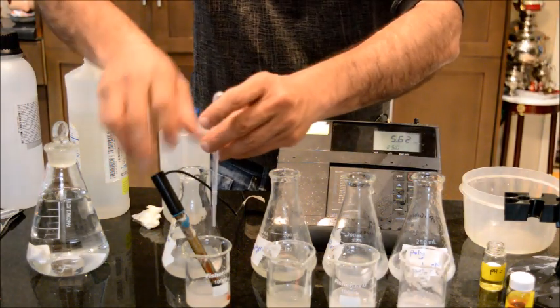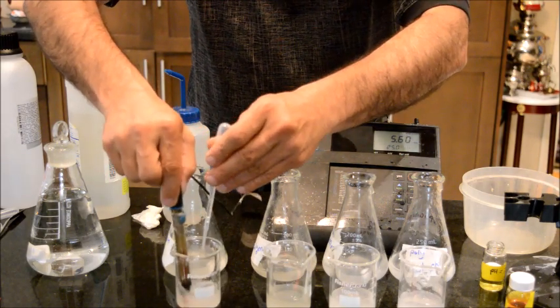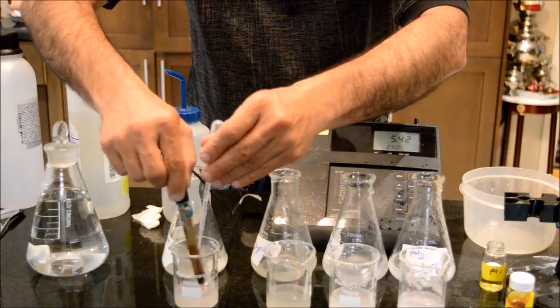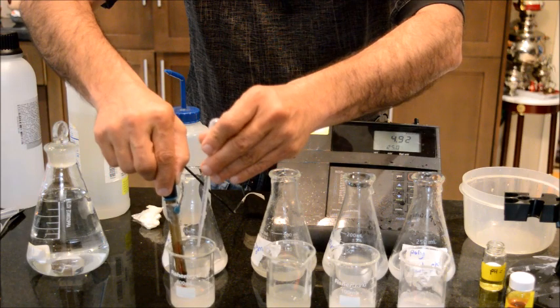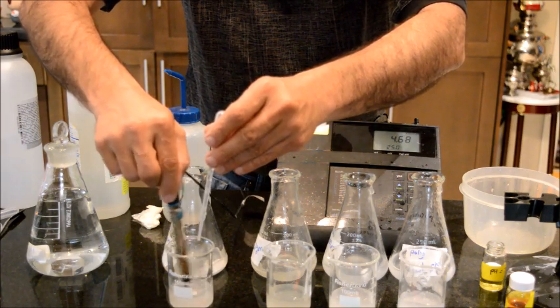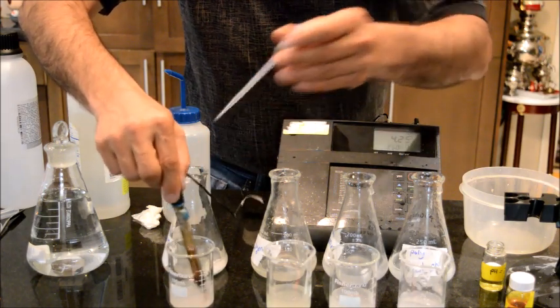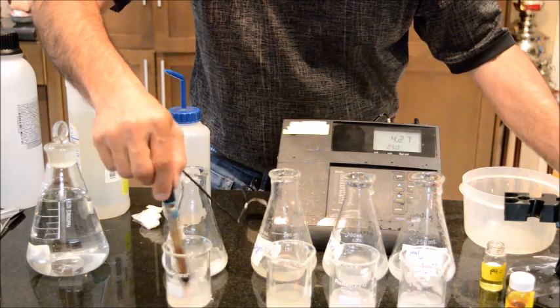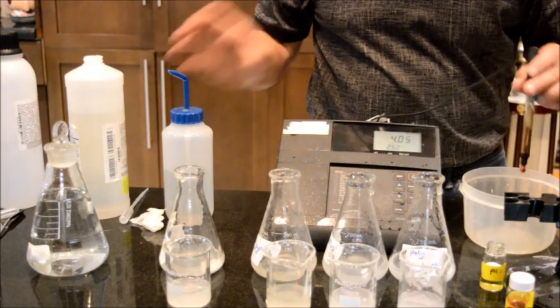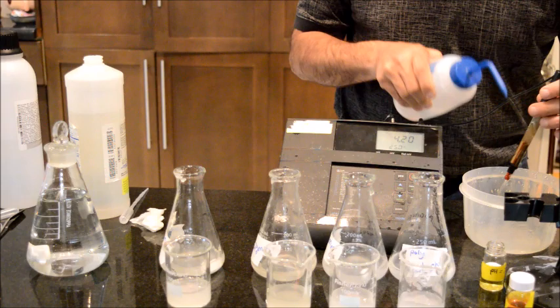Because the gelling agent is already too thick, I'm going to use the pH probe itself as a mixing device. So I try to get close to 4. I don't necessarily need to be exactly at the target. So I think 4.3 is good enough. So I will leave it as that. I want to avoid cross-contamination.